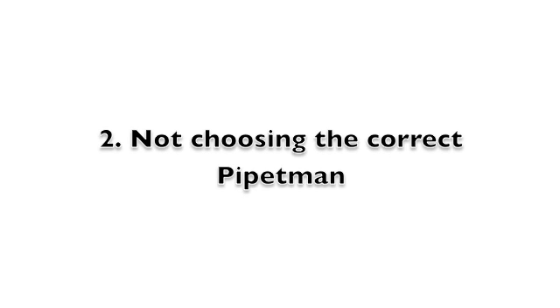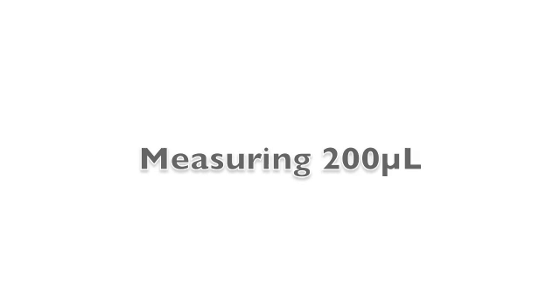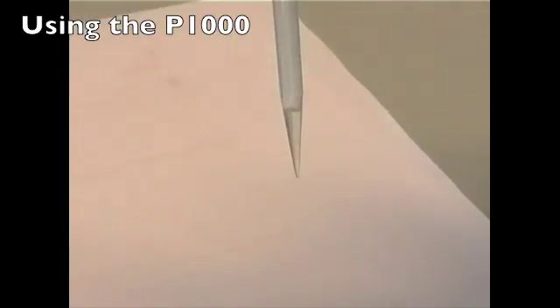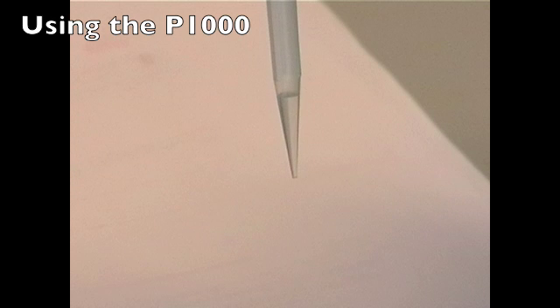Not choosing the correct pipette is an easy error to make when you first start to use pipettes. Using the example of 200 microliters again, using the P1000 to measure this amount is incorrect. Essentially, the pipette tip should be as full as possible, as this will reduce the chance of error.